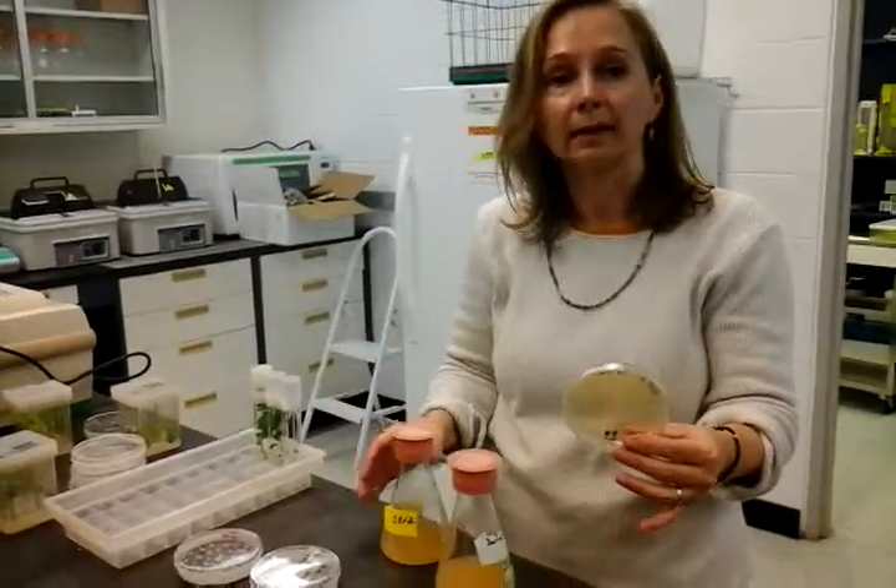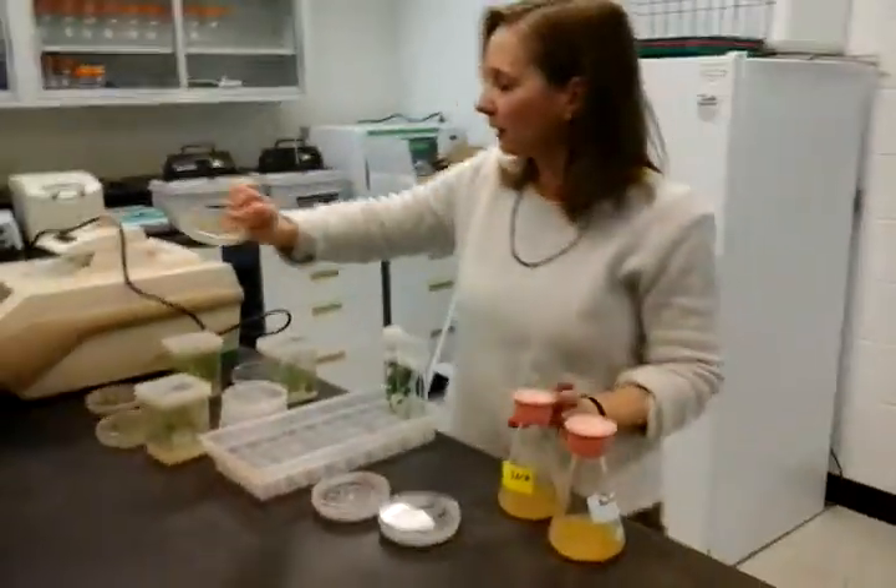PCR — polymerase chain reaction — it's for analysis. Just stop me and ask questions; we're so used to using jargon. Feel free to stop me. So PCR analysis — you can just pass it around and take a look at it.